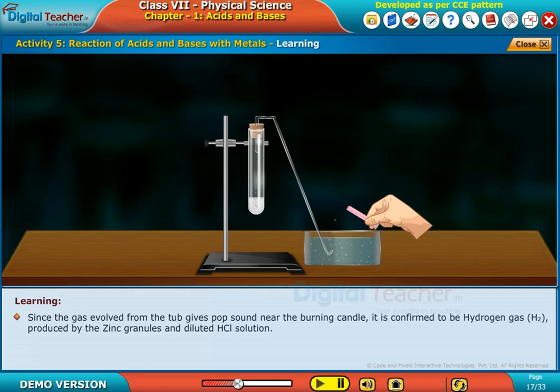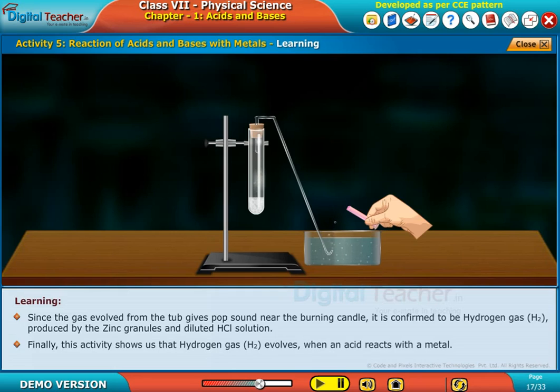Since the gas evolved from the tub gives a pop sound near the burning candle, it is confirmed to be hydrogen gas (H₂), produced by the zinc granules and dilute HCl solution. This activity shows us that hydrogen gas (H₂) evolves when an acid reacts with a metal.